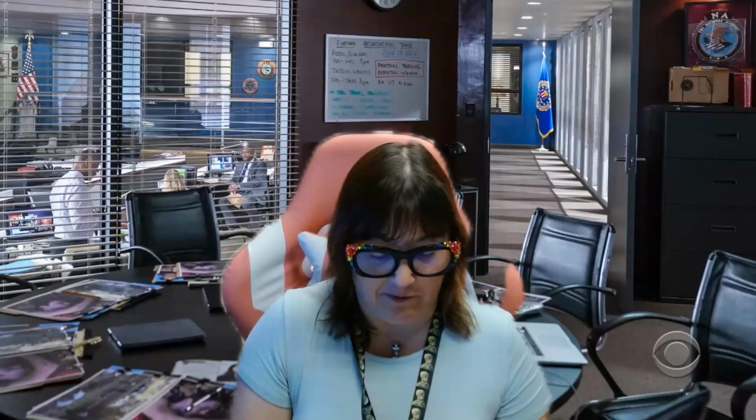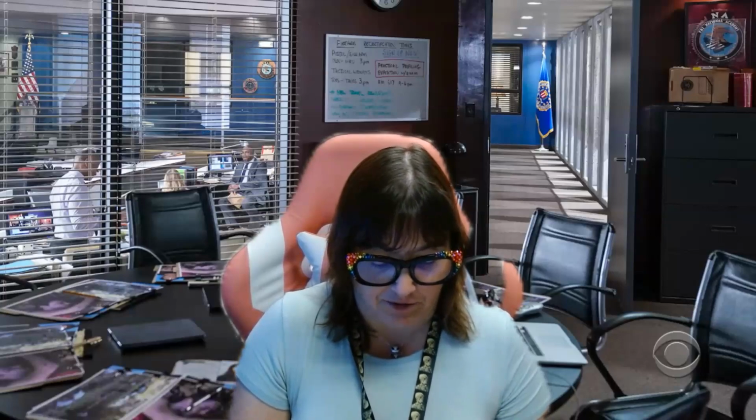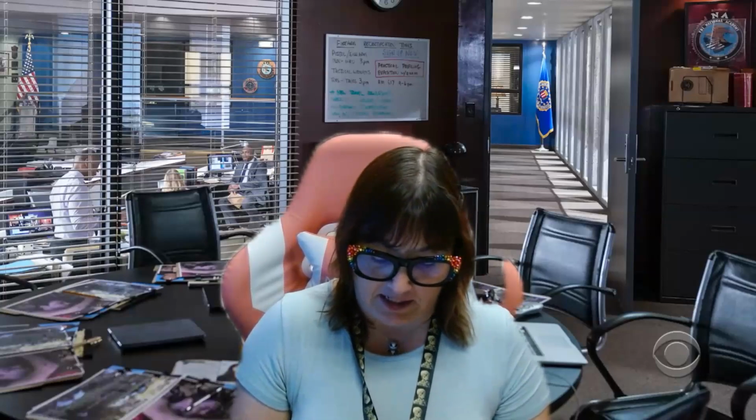I wanted to talk about Lab 5, what we have down as Lab Lecture 5, which talks about stoichiometry and the synthesis of calcium carbonate, which is the virtual lab 6. And when we do the synthesis of calcium carbonate in the physical lab, there are some other things that are done that are not done in the virtual lab.